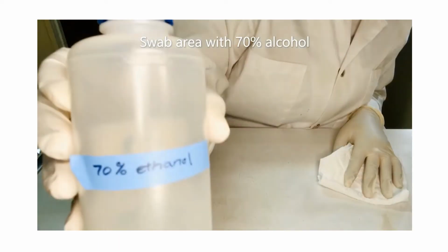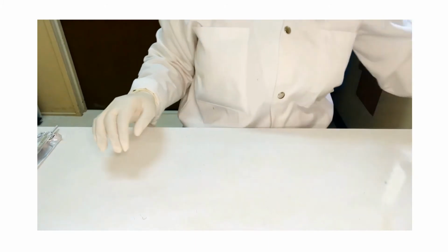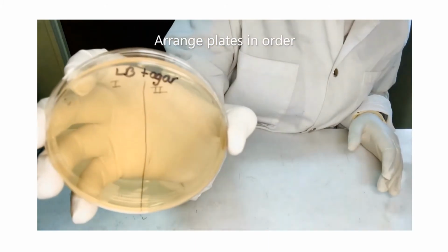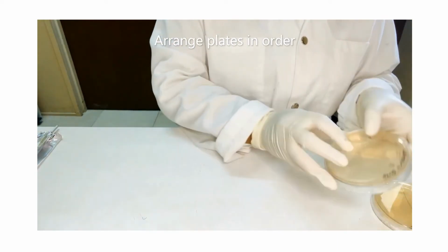Before beginning the procedure, the bench tops should be sterilized using 70% ethanol. Please observe each plate.